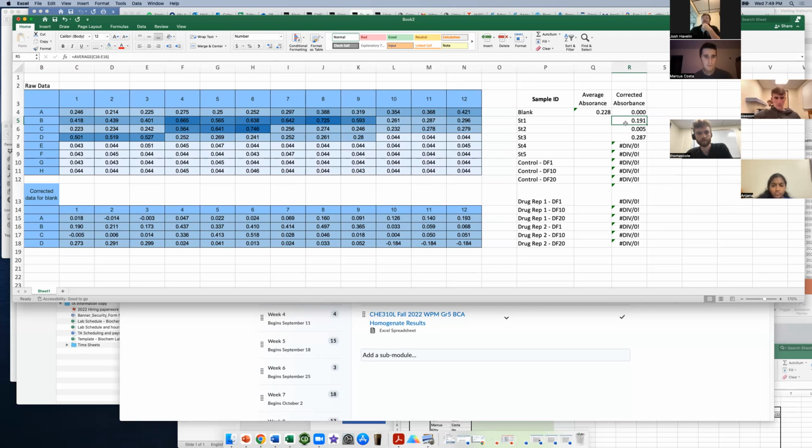Yeah, exactly. Excel's trying to help, but it's trying to help in the way that Excel tries to help. Because I copy and pasted that formula down, it took this information linked to here and just moved down one cell, right? And then this guy is down 2 cells. This guy is down 4 cells, etc. Excel will link and move things like that. So like I said, that technically makes more problems, but it's faster than typing average.